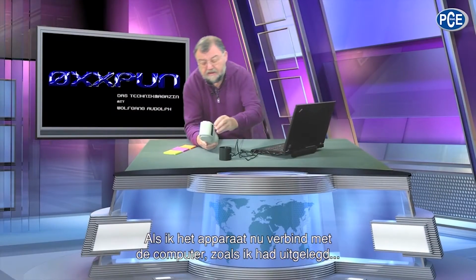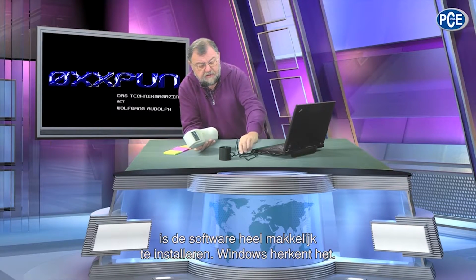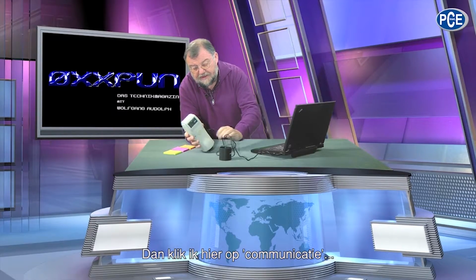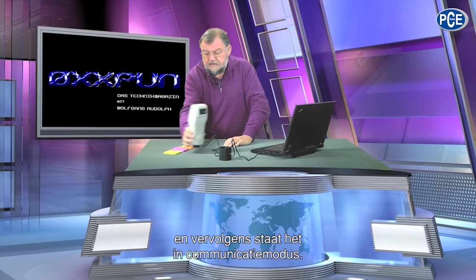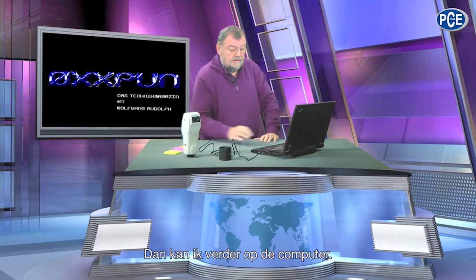If I now connect the device to the computer like already explained, the installation of the software is easy. It is recognized from Windows. Then you have to go to here at communication, and in this moment it finds itself in communication mode. Then I can carry on with the computer.